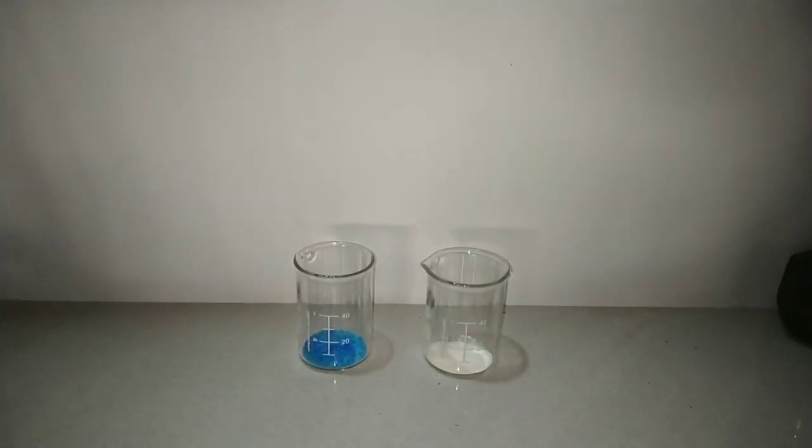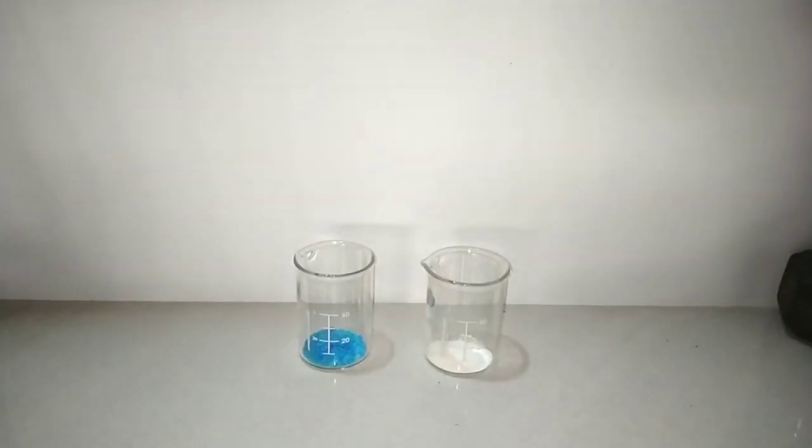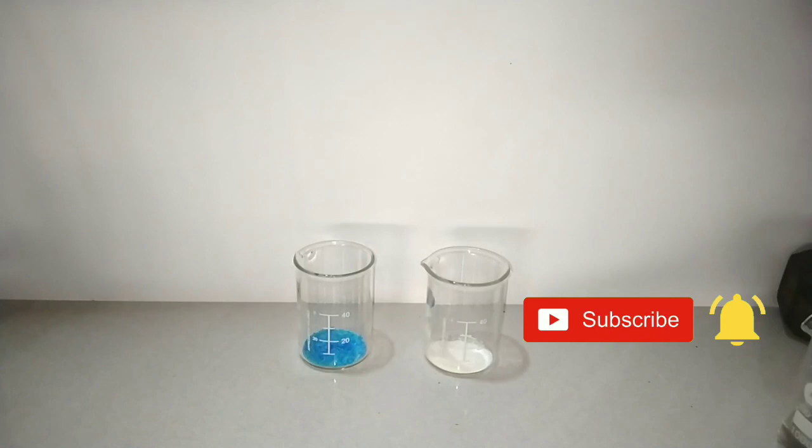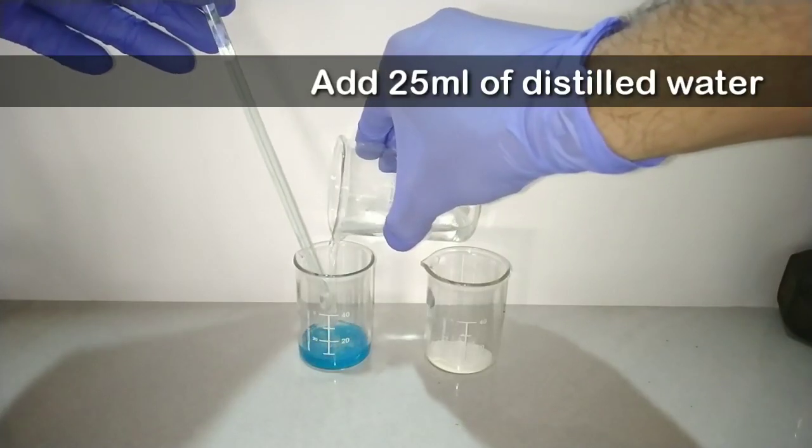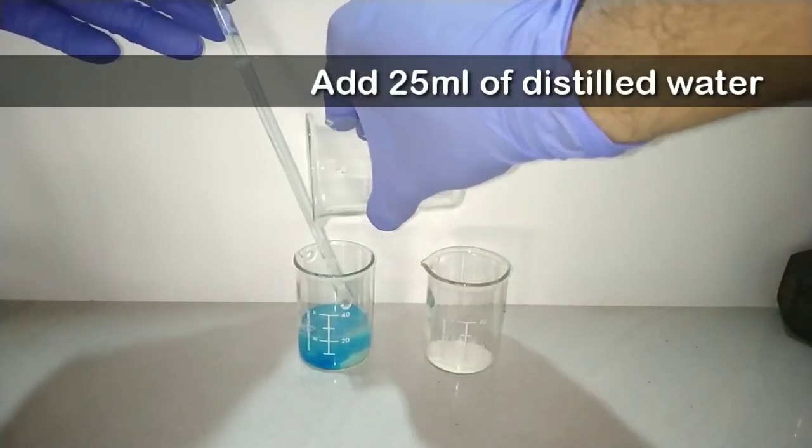Copper 2 sulfate is easily obtained as it is sold as a weedicide, and sodium metabisulfite can be purchased online—check out eBay or Amazon. Into the copper 2 sulfate add 25 milliliters of distilled water and mix it well.